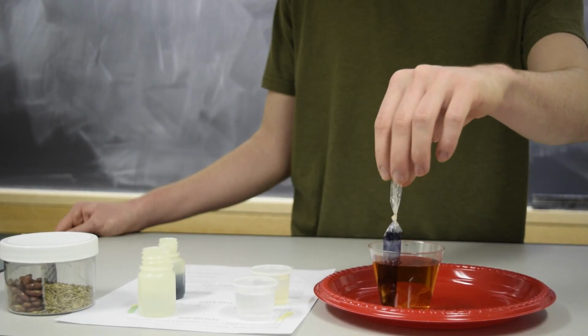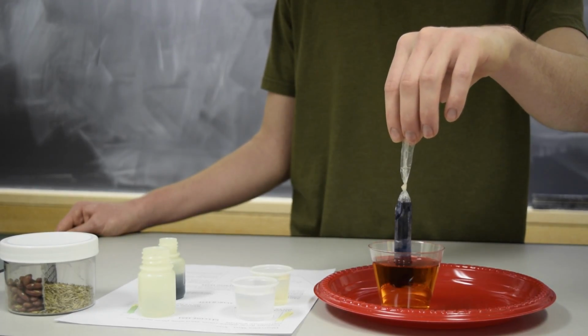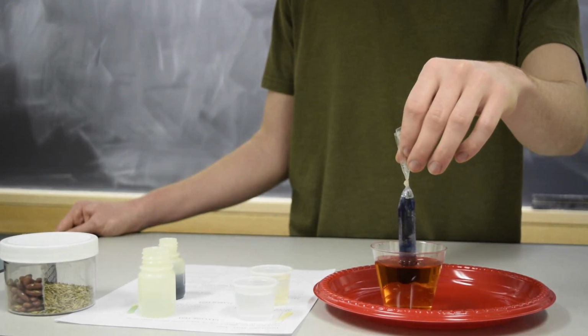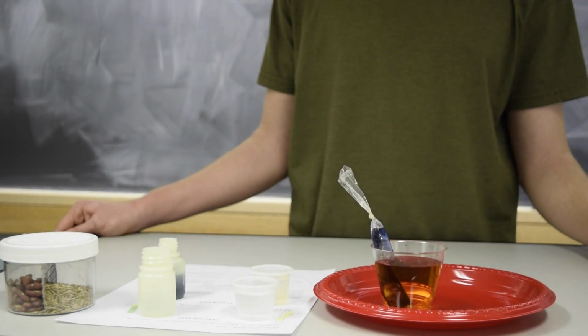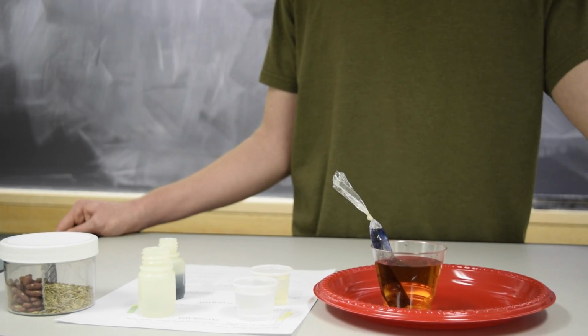In our experiment, the solution inside the dialysis tubing turned black while the water remained orange. This means that there was starch trapped inside the dialysis tubing that could not move out, but the iodine was able to move in through the dialysis tubing to react with the starch.